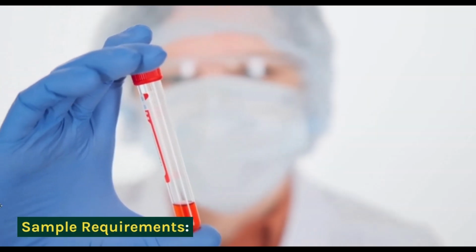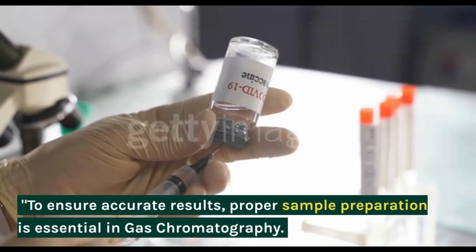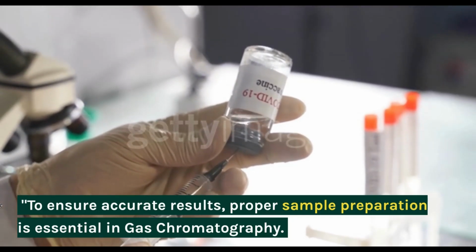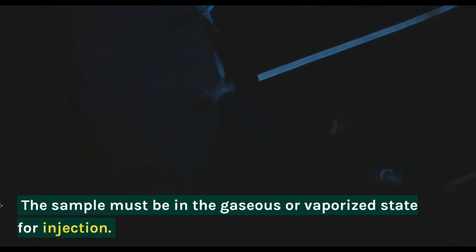Sample requirements. To ensure accurate results, proper sample preparation is essential in gas chromatography. The sample must be in the gaseous or vaporized state for injection.